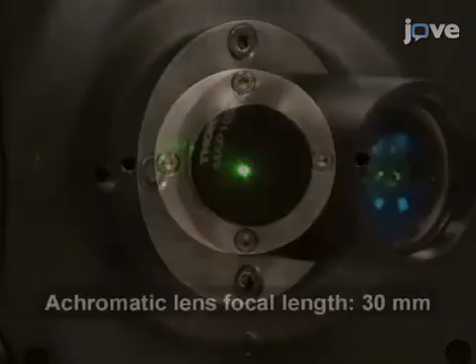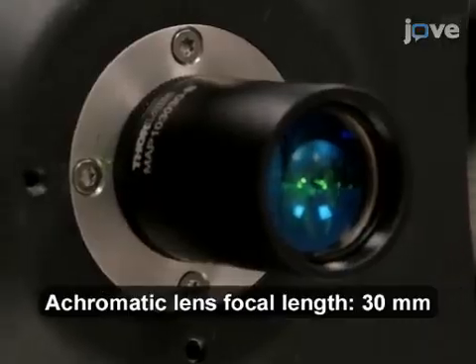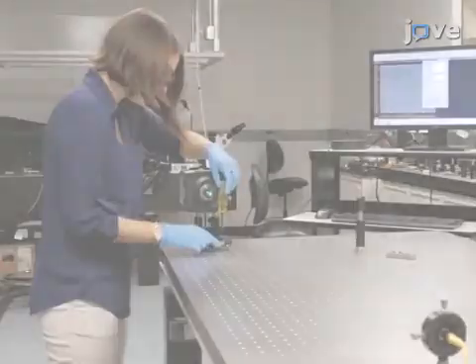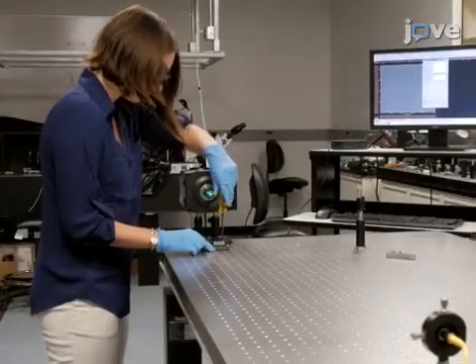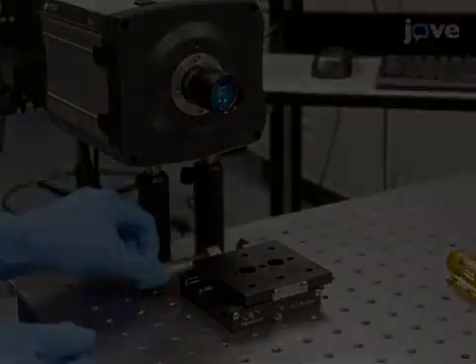This matched achromatic lens pair has a focal length of 30 millimeters. Now begin to add elements on a horizontal stage.